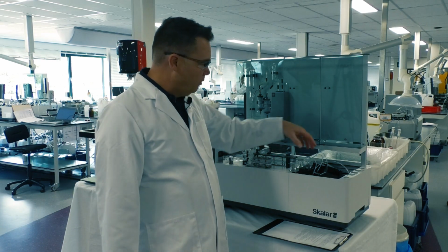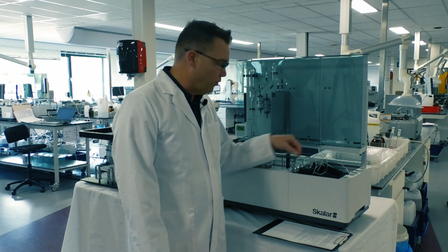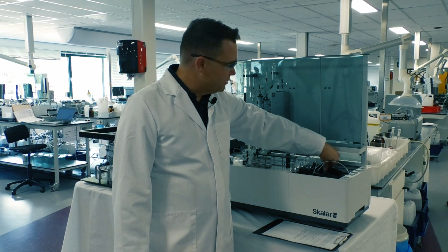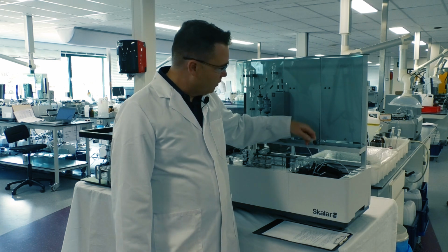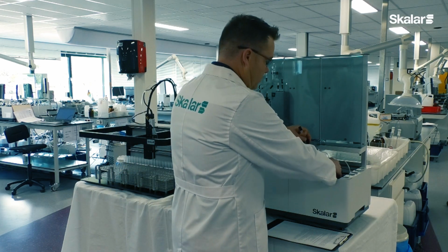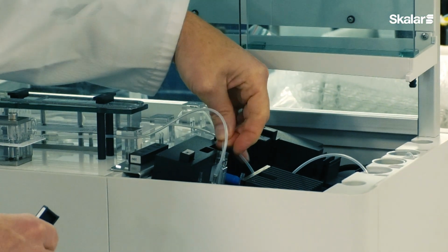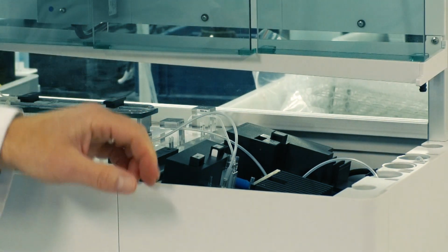So as you notice here, we've got a flow cell, and in this case, we're doing nitrate plus nitrite, which we're measuring at 540, and we have our 50 millimeter flow cell here. So if I needed to, let's say that I didn't have the second flow cell back here, and let's say I wanted to run my cyanides, well, I can very easily take the cyanide flow cell along with its wavelength filter, and I can remove the one I have here for ammonia. I can easily move the ammonia wavelength filter, also its flow cell, and just place the flow cell inside of the slot right there, and my wavelength filter, and voila, I'm ready to go.